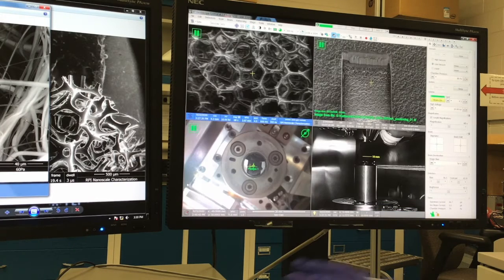So we can also do something else with our materials here. We can do so-called focused ion beam microscopy. In this case, inside the same chamber, we also have a second source, which is a source of gallium ions. The gallium ion beam is also getting onto the sample surface, and in the case of gallium ions, it's not only generating the secondary electrons or secondary ions, which can be used for imaging, but it is also capable of removing material.